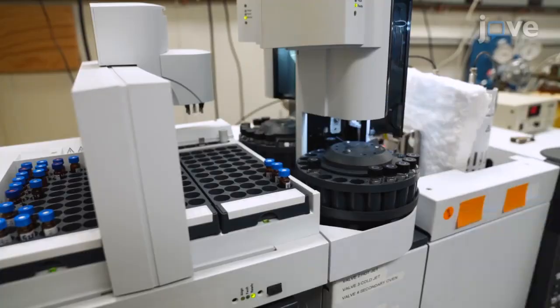The secondary GC column must be looped within the modulator, and if it's not aligned perfectly, the chromatography would be useless. So just take your time to get it aligned.